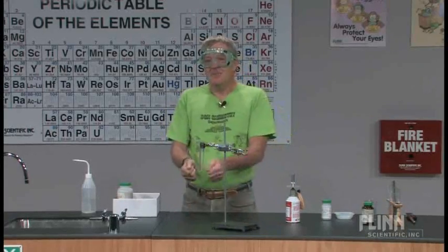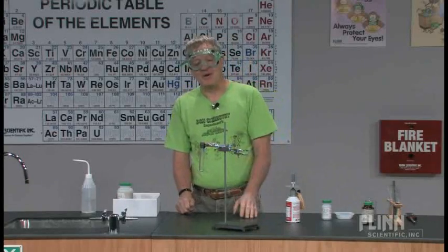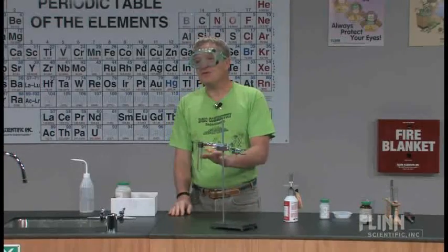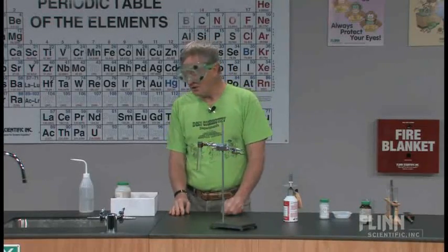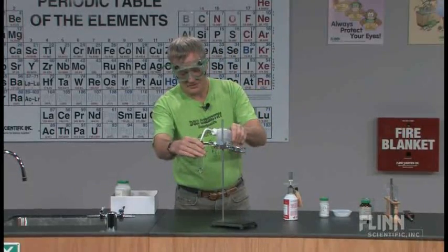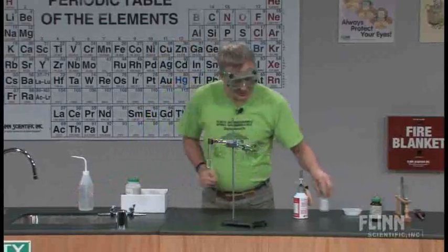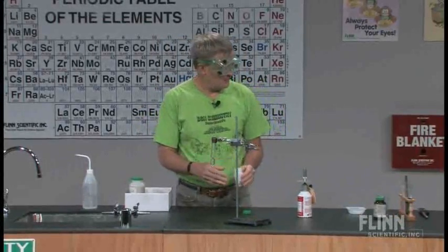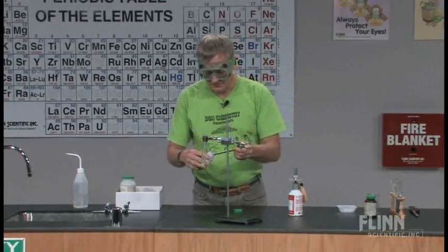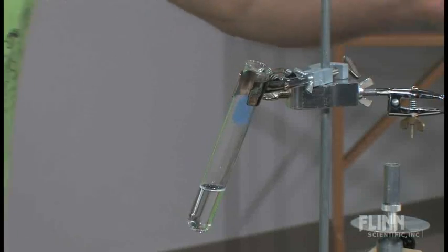That's fun. But to look at how active the stuff really is, we need to take a look at some more reactions. We're going to look at, first of all, the very simplest one, and that's just the fact that magnesium reacts with water. And so I'm going to put a small amount of water in a test tube, and I'm going to pour into that test tube a small quantity of magnesium turnings and just let them fall down into the bottom.